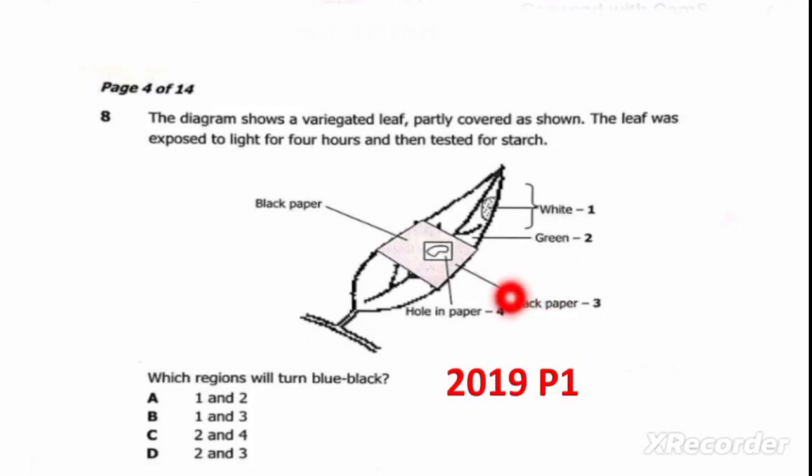So we have seen that here we have the white portion. This white portion will show the absence of starch, and the covered part will also show the absence of starch. The green part will show the presence of starch.